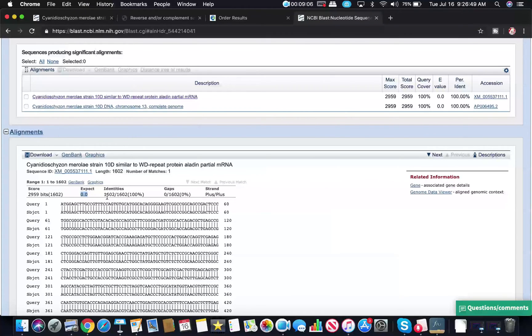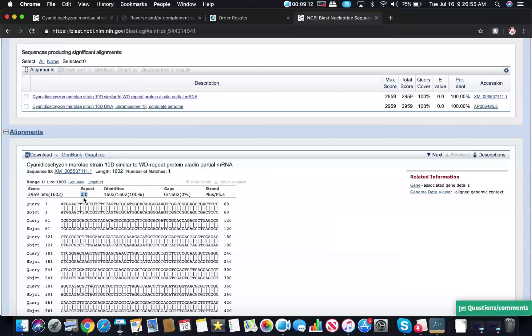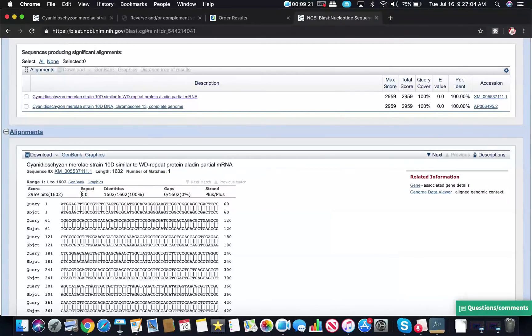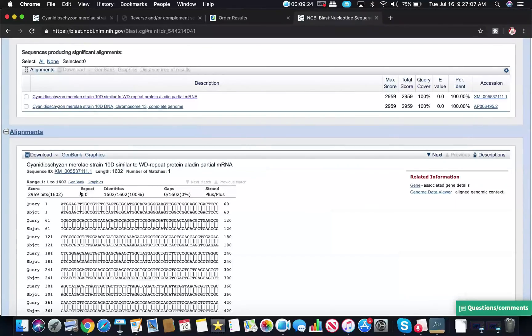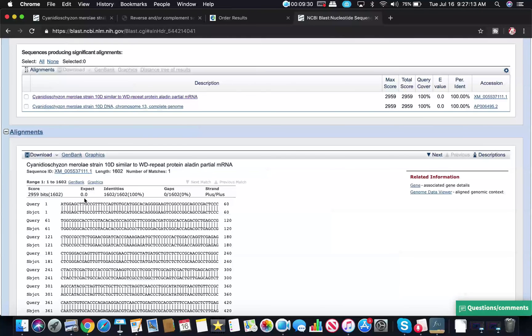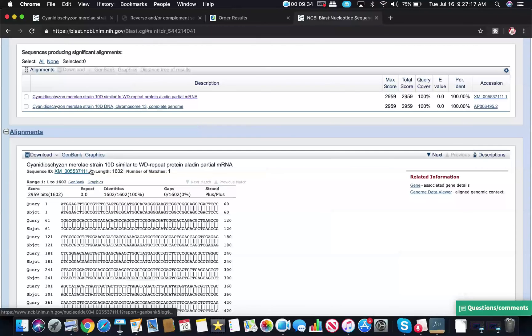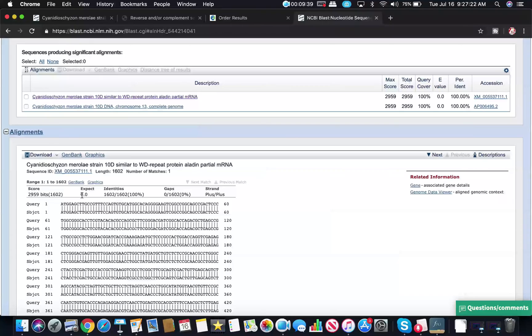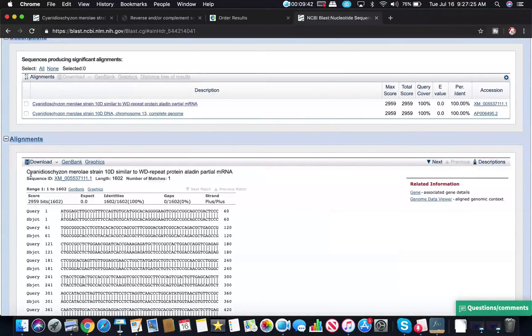Now we have an exact match here so this is actually going to be zero. But in some cases you might have something really small like 1.3 times 10 to the minus 28th. That's really small, and normally values like that are good. You want this expectation value to be low because what this says is the number that's here is basically the chance, the probability, that the sequence you input is not this gene.